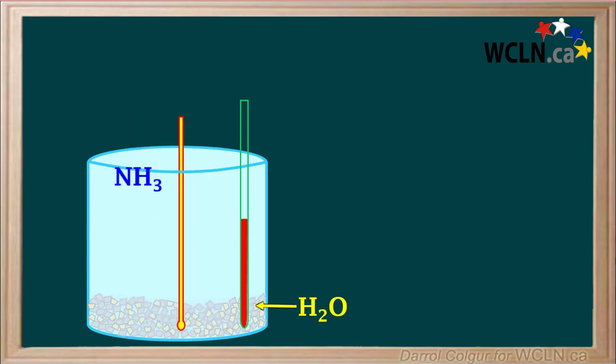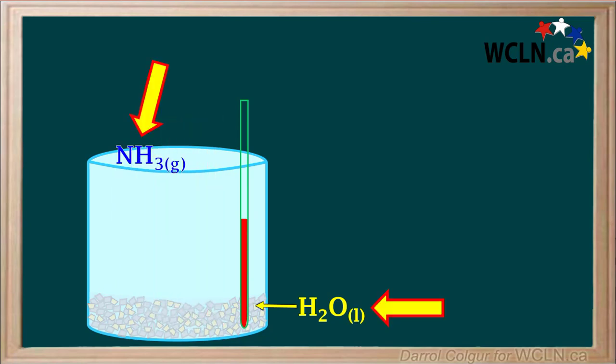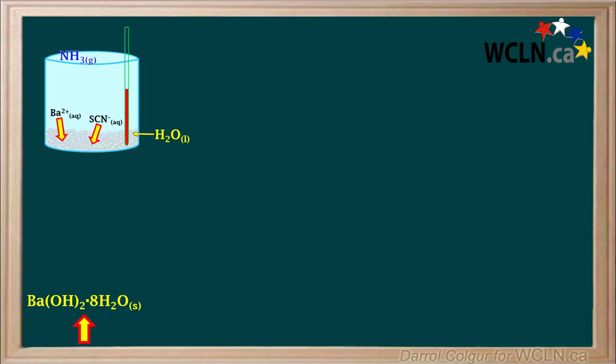We can also smell ammonia gas coming from the mixture. So two of our products are liquid water and ammonia gas. In addition, barium and thiocyanate ions from the original solids are now dissolved in the water that formed.